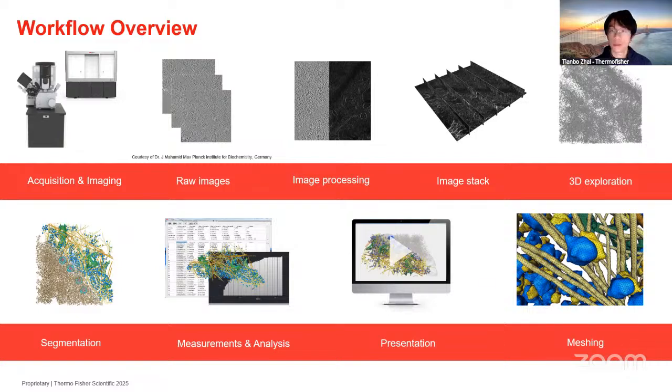So this is also available inside the software. To put it in short, AMIRA provides you a one-stop image analysis platform where as soon as you acquire your raw data, you could start analysis. And the final deliverables many times are the statistics of your choice.